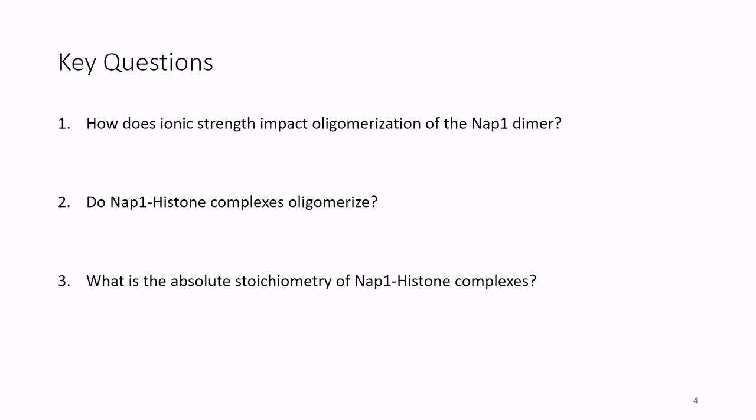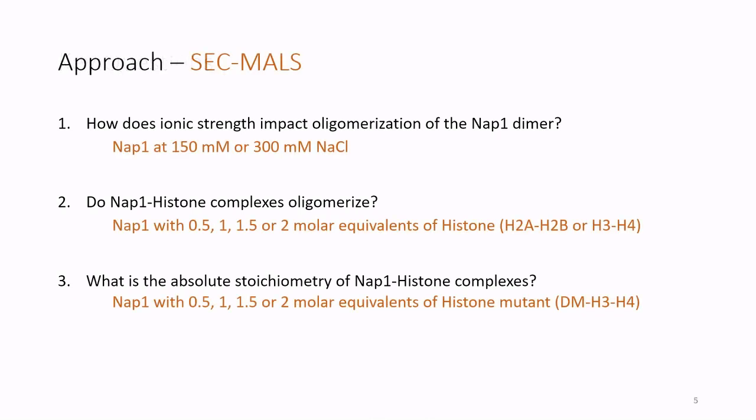In order to do this, we used an approach called SEC-MALS, and this is where I'll pass over to my student, as he's the one that did all of the hard work. Thanks, Sheena. So all of our questions can be answered using a technique called SEC-MALS, and I'll tell you what it is in a little bit.